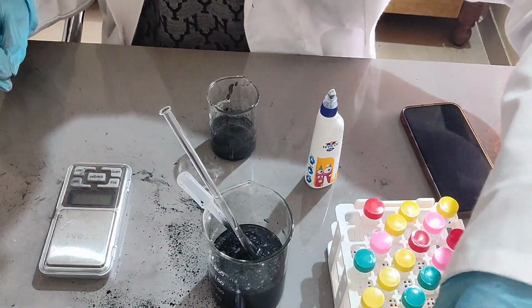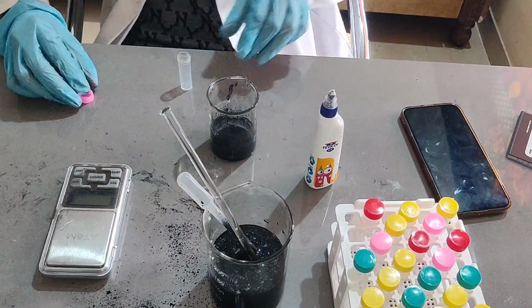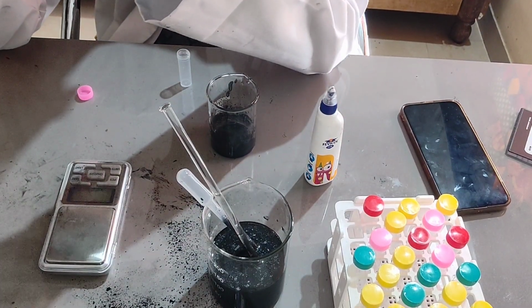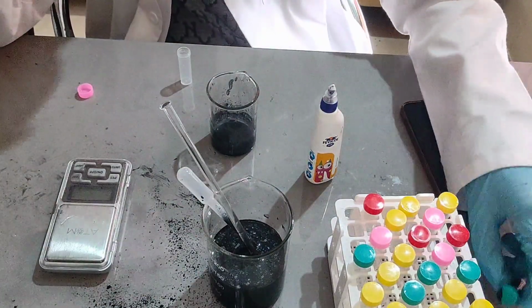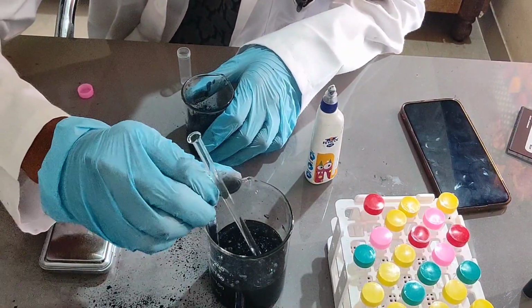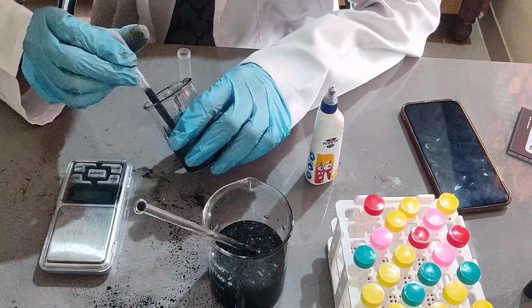One more thing that I've noticed is that our samples in the ethanol suspension, the graphite doesn't fall out of the suspension that much. Okay, so it might be a property of acetone. Trying to add this.